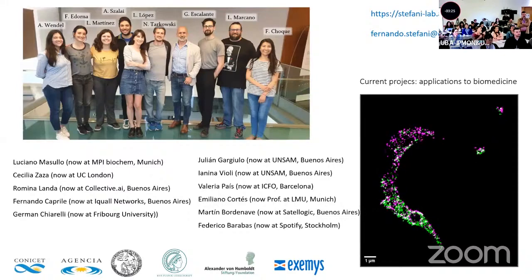Okay, very good question. We'll just repeat it in English. So the question is about what happens in single molecule localization microscopy, like STORM or PAINT, these methods that work on blinking molecules, what happens to the molecules that are out of plane?